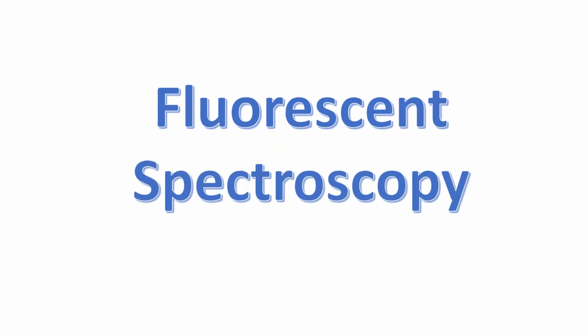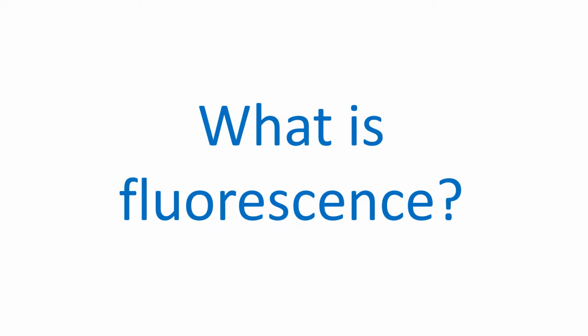In this video, we will discuss the concepts and applications of fluorescence spectroscopy. Topics covered will include basic background theory, how it works, and some instrumentation. There will be a special focus on applying fluorescence to monitor peptide cleavage and enzyme activity. So to begin, what is fluorescence?